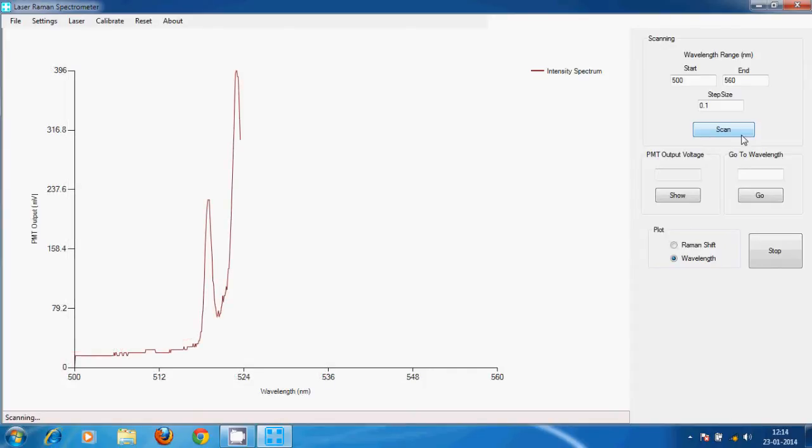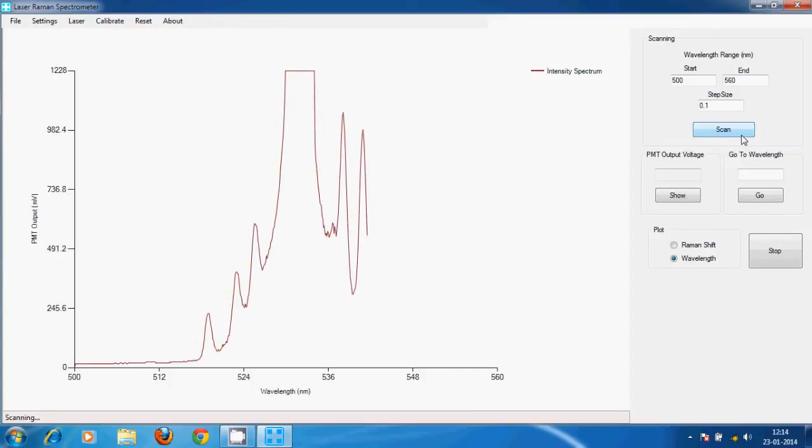The software developed for the instrument has facilities for setup and calibration in addition to scanning and manual readouts. The software saves and displays the data collected.